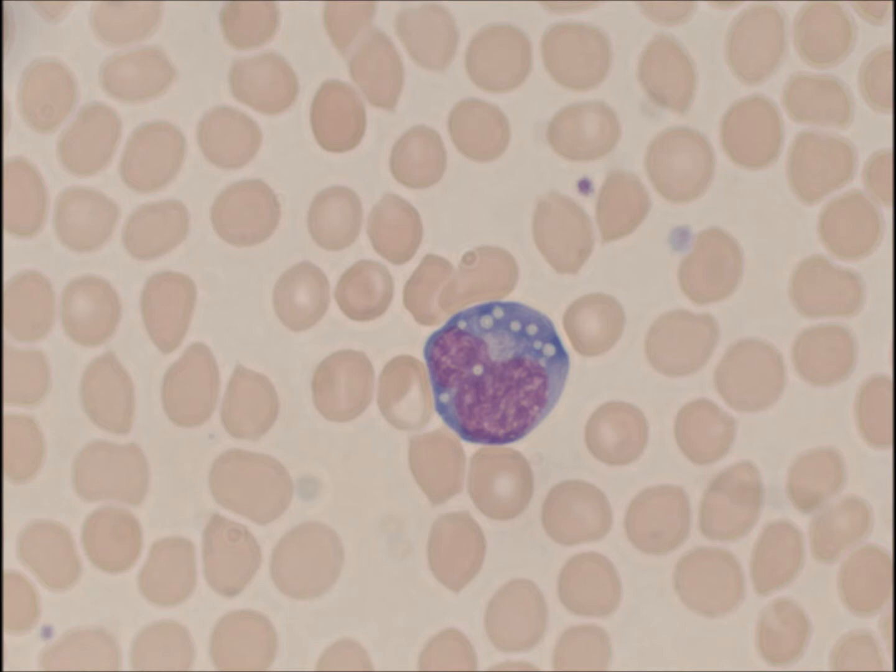Hello everyone. Today I wanted to talk about Giemsa stains. The purpose of this stain is to locate blood pathogens.